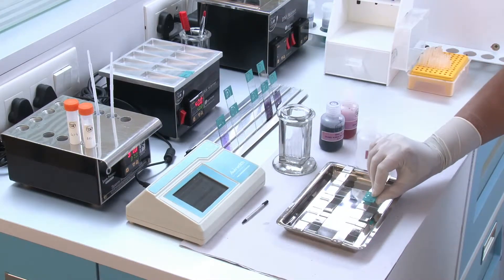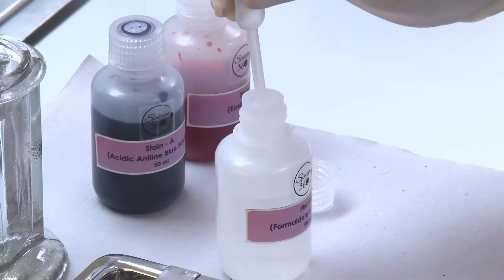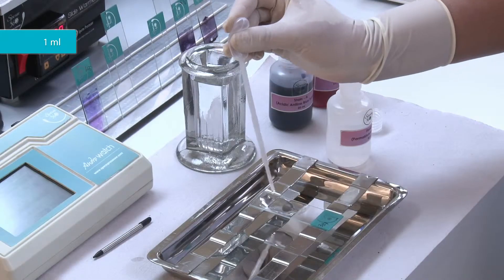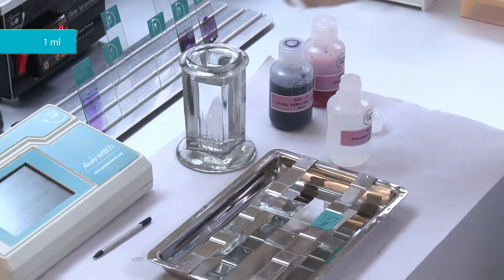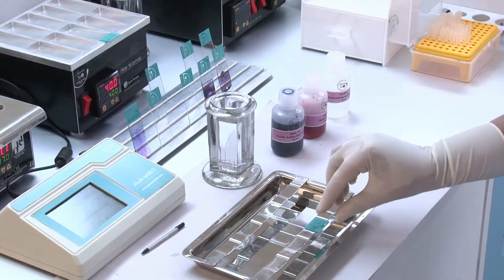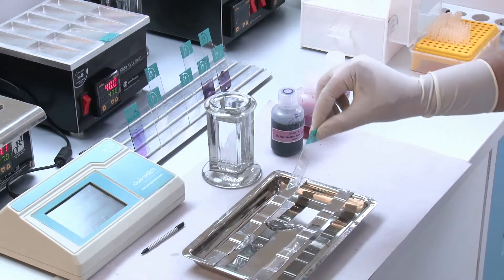Keep the slide horizontally on the staining tray. Cover the smear with 1 ml of fixative solution. Keep it for 5 minutes. Drain off the fixative solution.